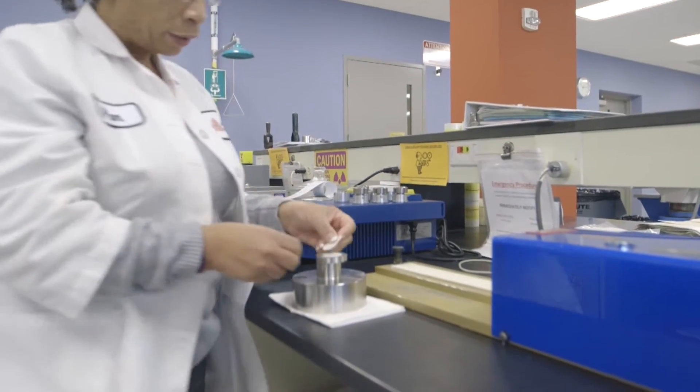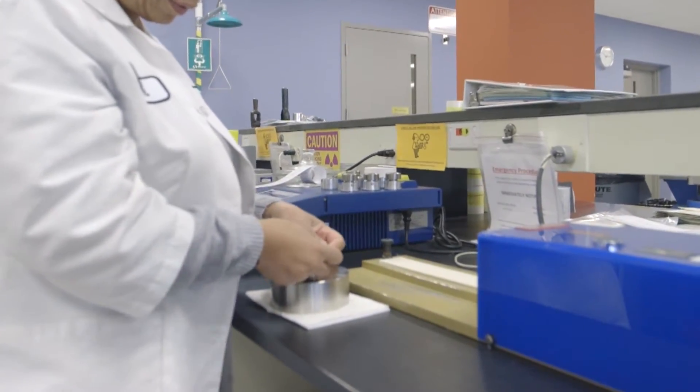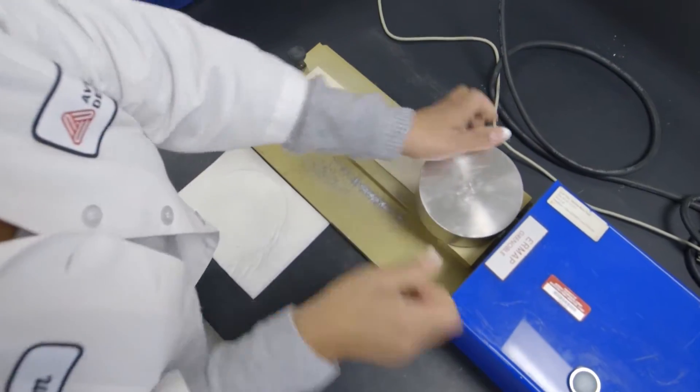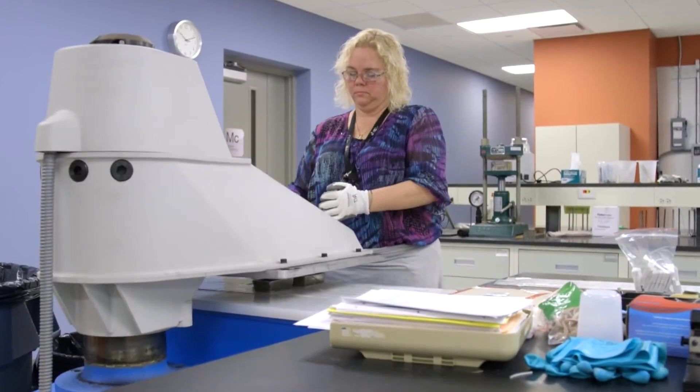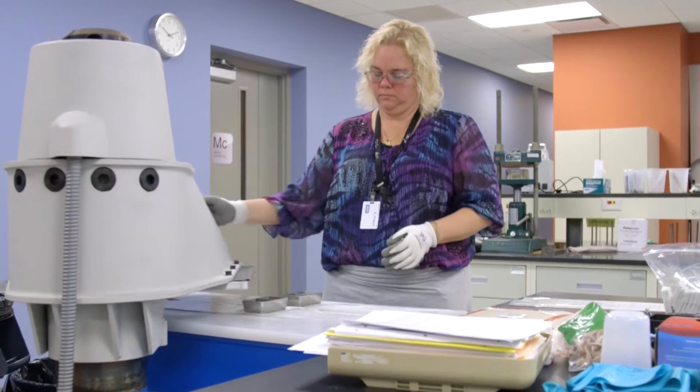As the inventor of release coatings, we have a keen understanding of how important productivity is for you. Here in the release area, we test silicone and silicone cure and coverage to help you ensure the proper speed and feel of label removal.